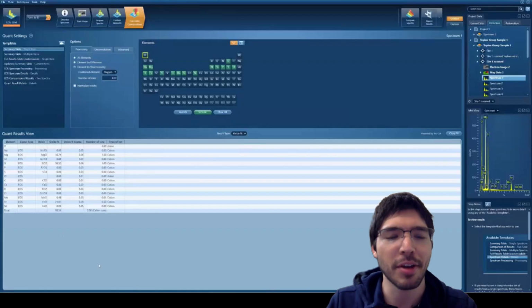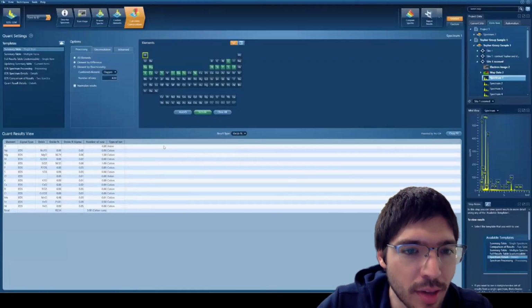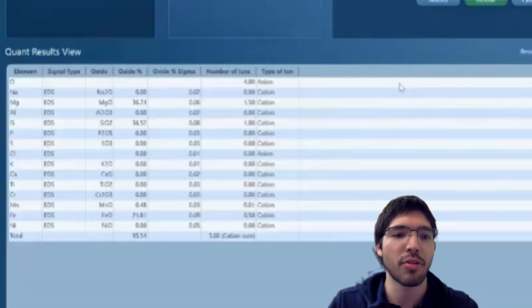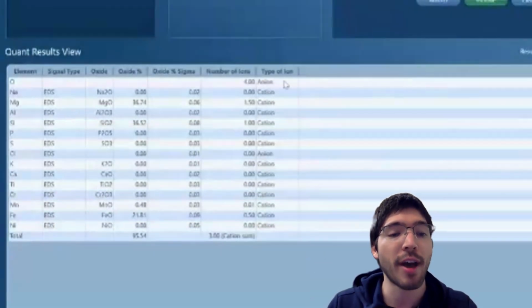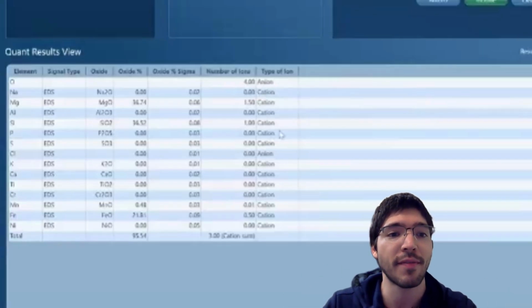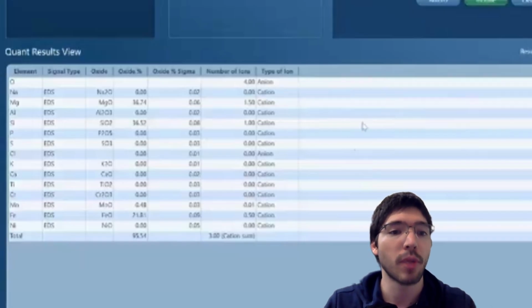Here you'll see I'm talking a little bit about some of the data points that we collected. For example, this is one point that we collected on an olivine grain, and I'm just explaining a bit on calculating the fayalite value, which is essentially just looking at the ratio of iron over iron plus magnesium. And that's a very valuable tool when you're trying to classify different meteorite groups, particularly in the ordinary chondrites. The H, L, and LL chondrites are known to have distinct fayalite values in the olivine, and you can use this to classify between them quite well.